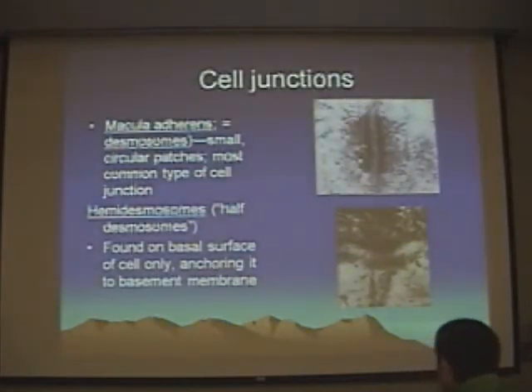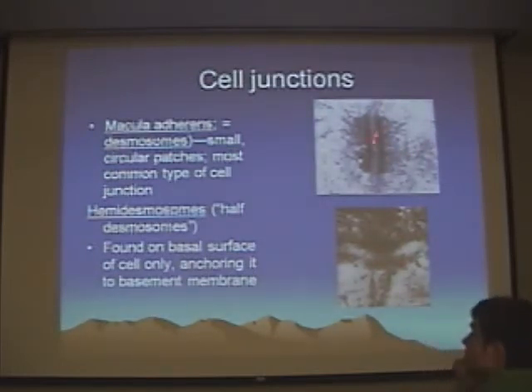Yeah. Well, because it's such a really little bit, it's very dark, and the rest of it's light, so it's just a little tiny bit. But yeah, depending on if you didn't know the magnification, it would be almost impossible. Okay. You'd have to have some knowledge of what the entire span looked like. And nuclear pores tend to have a fuzzier open space in the middle, and then they'll be darker at the edges. But the bottom line is I won't be showing you a nuclear pore yet. So if you see something that looks like this, call it a desmosome.